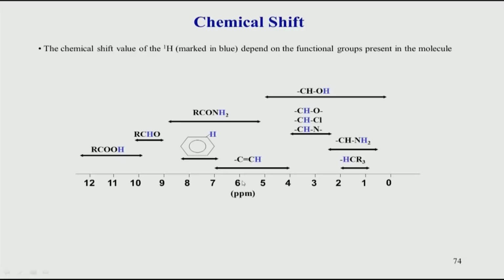The chemical shifts you typically see for different functional groups come in this particular zone. This is a hydrogen spectrum, a proton spectrum. You can see here the scale is marked from 0 onwards towards the positive side, and typically this is what happens in all organic compounds. We choose 0 ppm as a reference; we will talk about the reference a little later. Suppose we set it to 0, all the typical compounds studied in organic chemistry fall on the downfield side compared to 0. So, anything more than 0 is shifted downfield with respect to the reference.